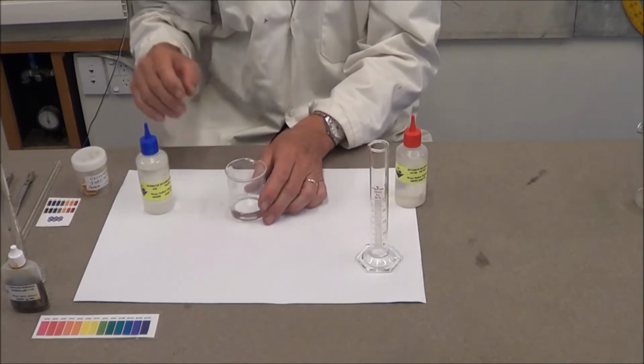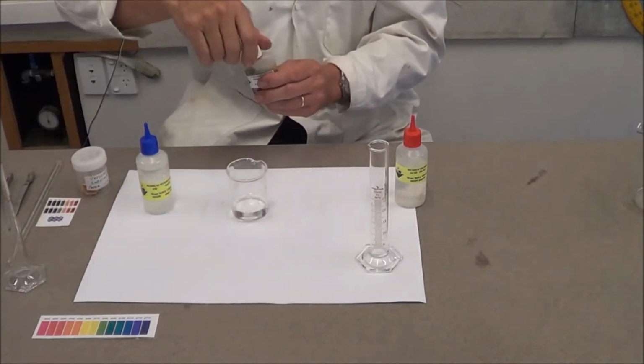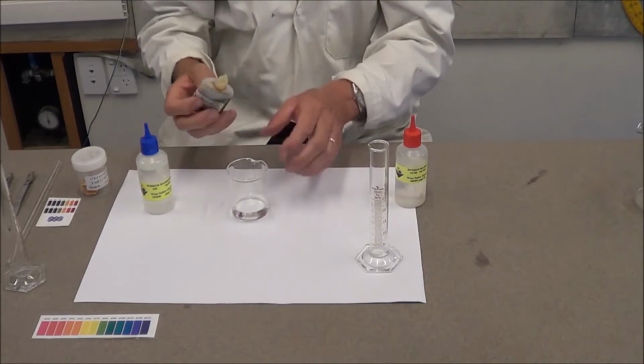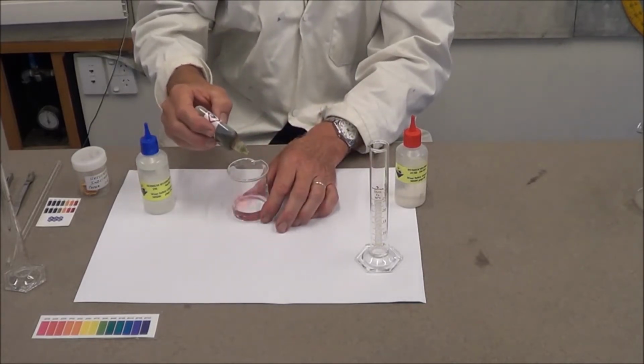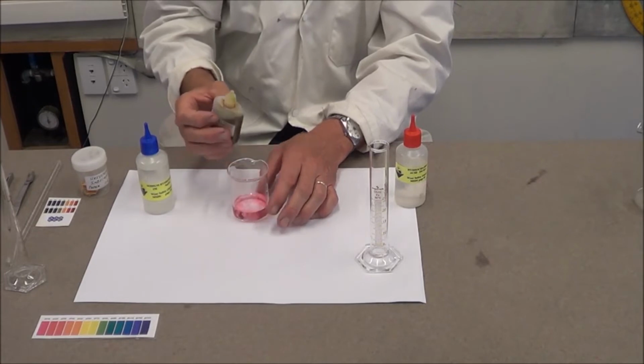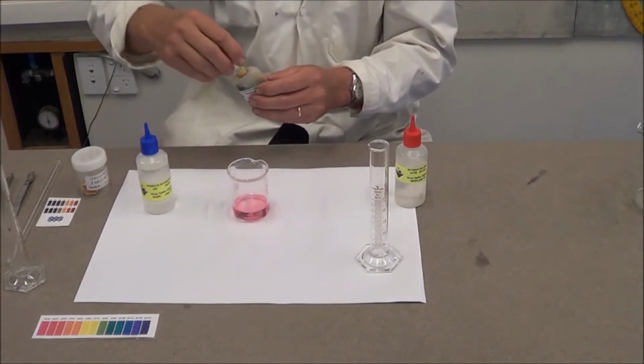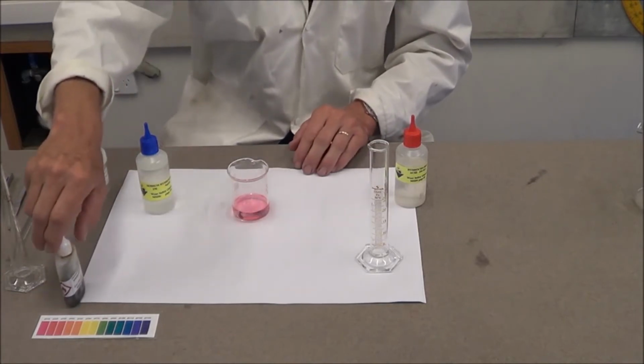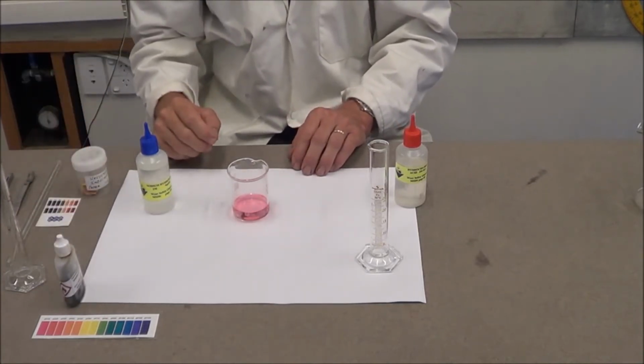So that we can know when the reaction is over, when the acid is completely neutralized, we add 5 drops of universal indicator to keep track of the pH. It should be completely neutralized when the pH is 7.